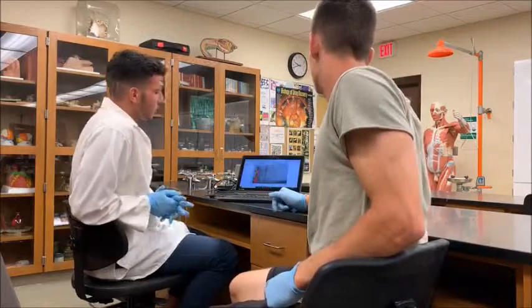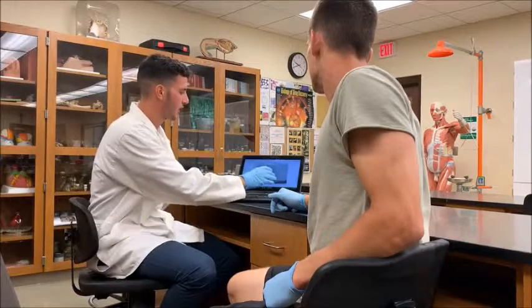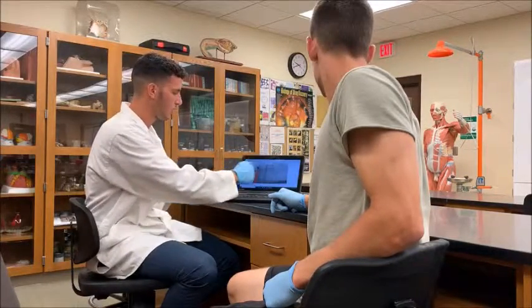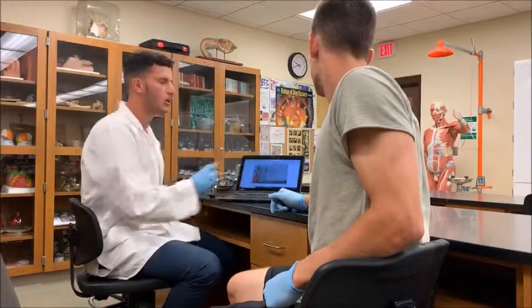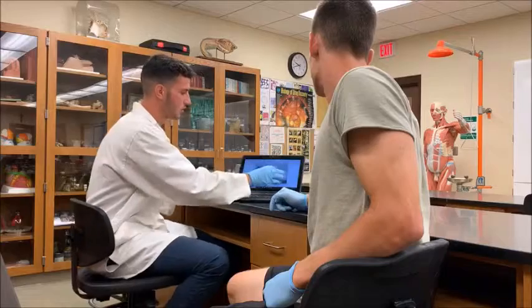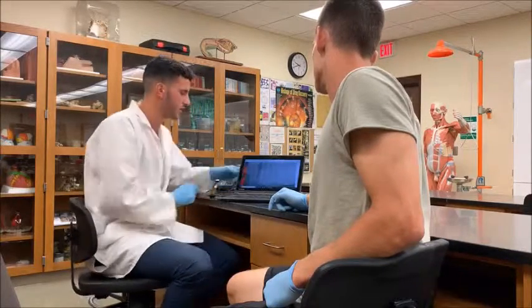Yes, absolutely correct. Imagine this, refer again to the model with the toothpick, and here you have your control marker with all the molecular weights of the known proteins, and then we're going through the progress of purification until here you get, in the last one, a single band, if you can see it here.